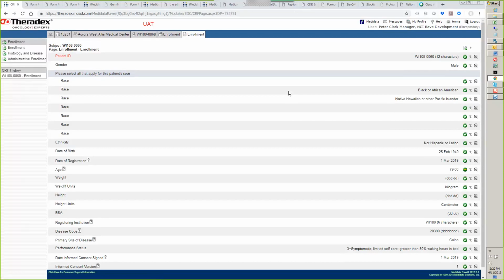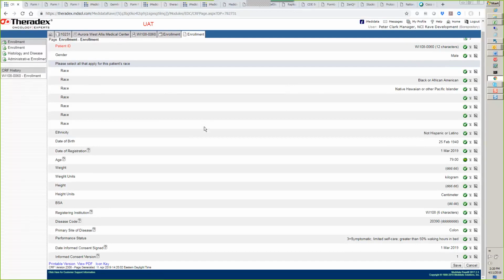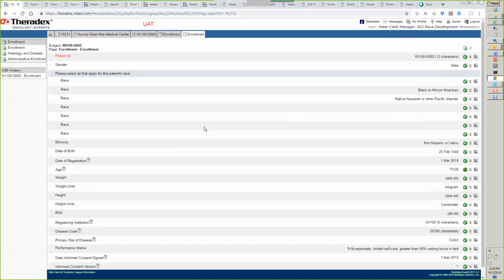In other words, nothing in this folder is something that you need to modify or can modify with the biorepository role. And I can't pretend to know if you need all of these data points or not, but Percy Ivy thought that this would be a relevant set of data points that labs would all need to be able to access.